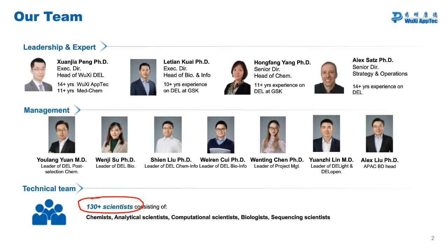How important is sequencing depth to calculate the enrichment? It's relatively important. As the sequencing depth becomes worse and worse, your ability to detect your binders gets worse and worse too. However, we've sort of figured that out, and we do know the sequencing depth that we need for DEL Open and for our self-service kit. So we sequence the correct amount, whatever that is. I would say that before next generation sequencing, doing this kind of DEL screening just wasn't possible.